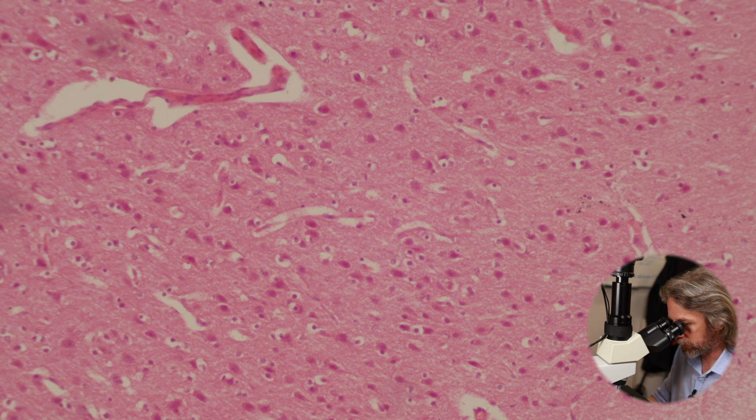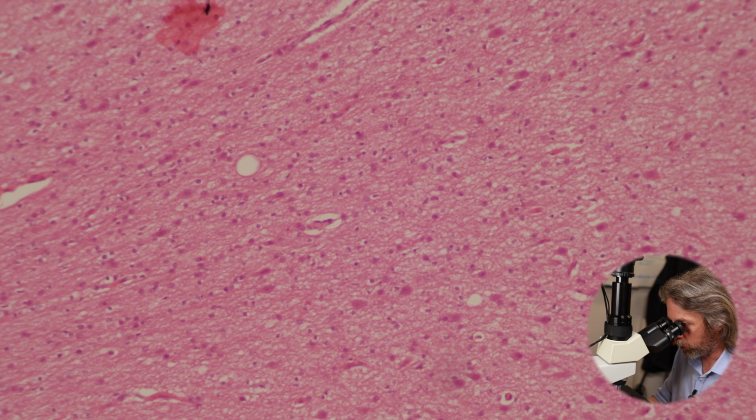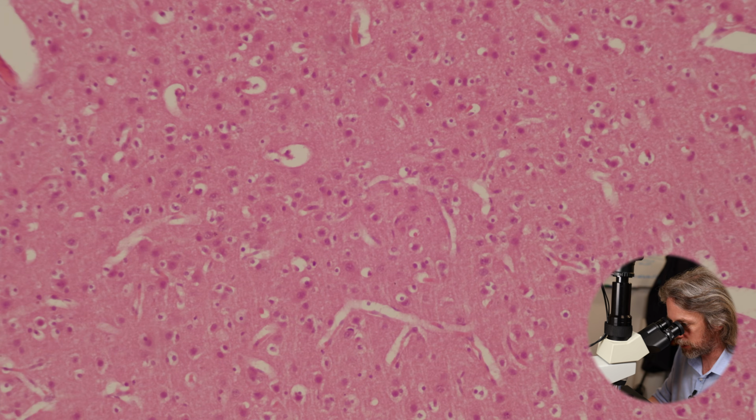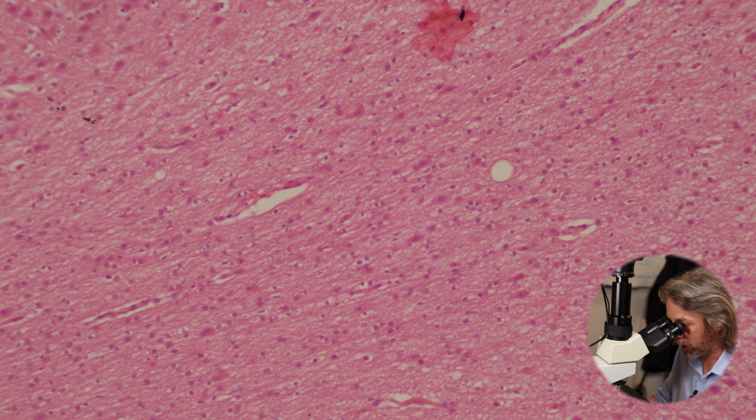That may or may not look like the peripheral nerves. So what we've got is, towards the edge, we've got the grey matter. We're looking at neuron cell bodies in there and support cells. And then as we go away and we go to the middle bit, you can see how that looks different to that. That is the grey matter, and that then is the white matter. So in the white matter, we've now got axons running away from those cell bodies or maybe running to those cell bodies. But anyway, we've got axons running through the white matter, and of course the white matter is white because the axons are surrounded by myelin made by the oligodendrocytes.